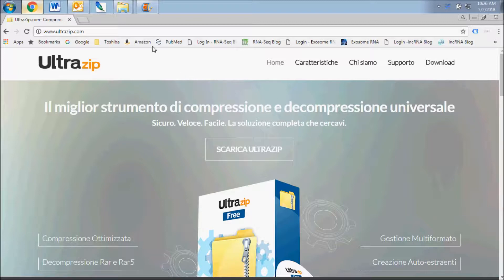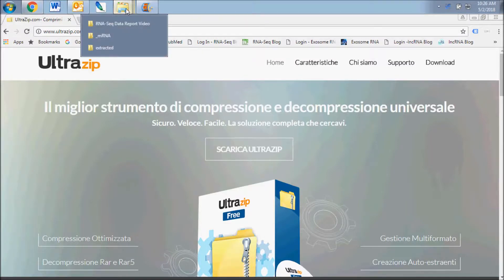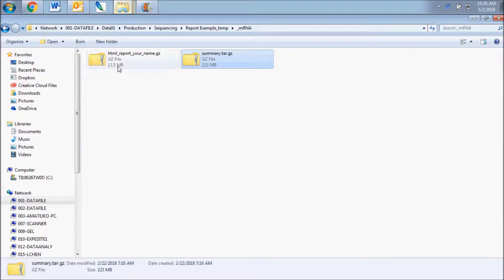Sometimes there will be a compressed archive folder within the archive folder. Make sure you have fully uncompressed all folders before moving on.